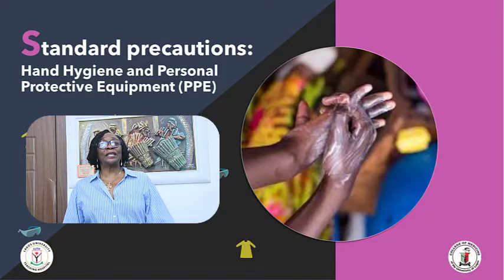Hello, we will be taking two components of standard precautions today: hand hygiene and personal protective equipment.